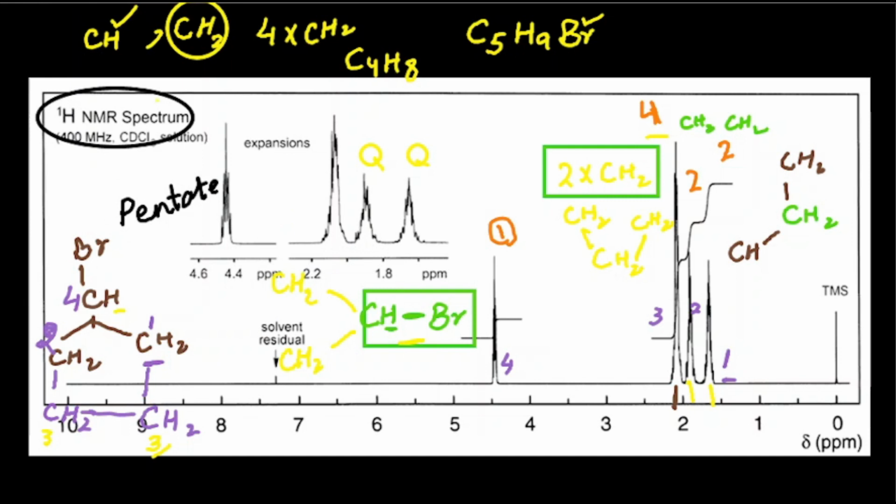As you know that here, this bromine is attached with the carbon with the single bond, and here the ring is present. So it means that if this bromine can rotate around this carbon atom, when it rotates, it gives us a slightly different chemical shift value to this CH2 group and to this CH2 group, because of which in the spectrum we get the two peaks that have a slightly different chemical shift value due to this reason.